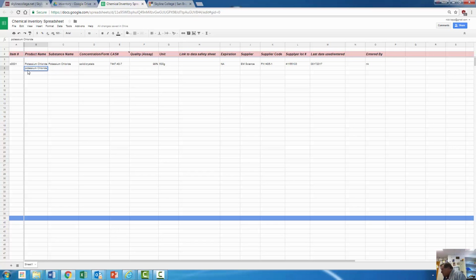And so let's get another chemical, and I have one in here in my office. And so here's another chemical that we would use. I'm going to change the name, and so this particular chemical is acrylamide.